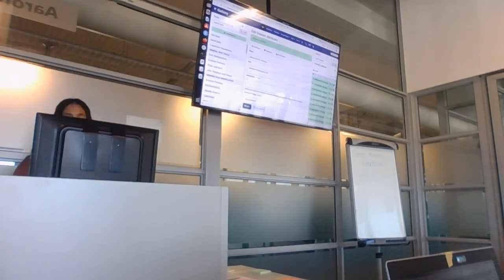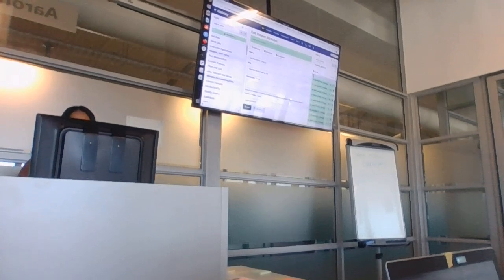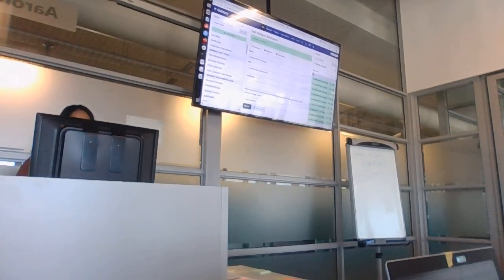Okay. So here we see what differentiates the forward reads from the reverse reads. What's the pattern here? What is common in all the forward reads? Underscore 1, and the reverse most probably underscore 2. We need this information to build a dataset. So if you look at this arrow, this little block over here, we're going to now create a collection. But because we have Illumina data, we also want to make sure that we pair the forward and the reverse.